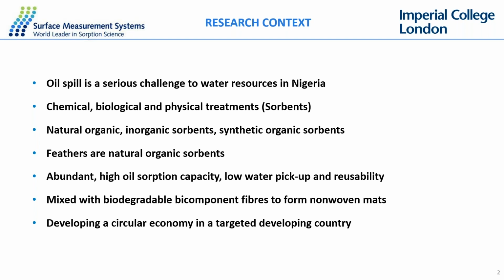Over the past years, oil spill cleanup is handled in three major ways: chemical, biological, and physical. All three methods have their advantages and disadvantages. But presently, the use of sorbent, which falls under the physical method, is preferred because it has less environmental impact. Sorbents are insoluble materials or mixtures used to recover liquids through the mechanism of absorption or adsorption.